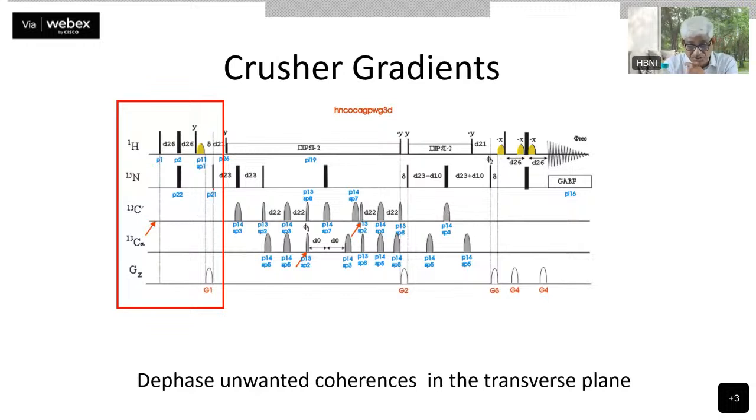So at every step we can do this. Every time you want to do a magnetization transfer, you separate the two transfer pulses by a short period and apply a gradient in between. Same thing is done here, for example. See, from here to here, you want to transfer the magnetization that has come. And the same is from here to here. Same is here, the G3 gradient, and then the next pair of pulses. In the normal experiment, these pairs of pulses were shown as simultaneous pulses, one above the other. But here you have slightly separated them to introduce the gradients in between.